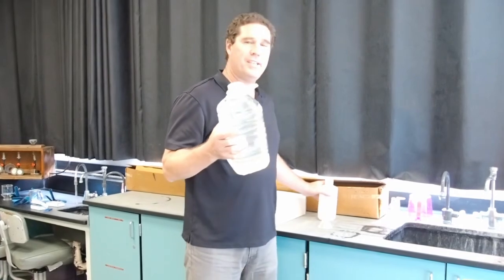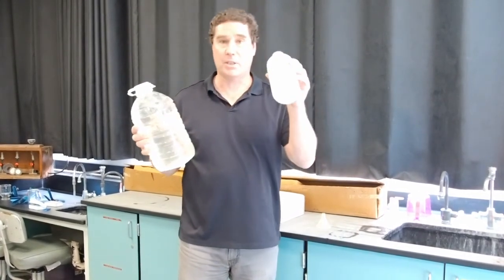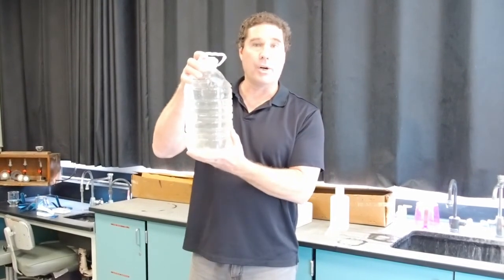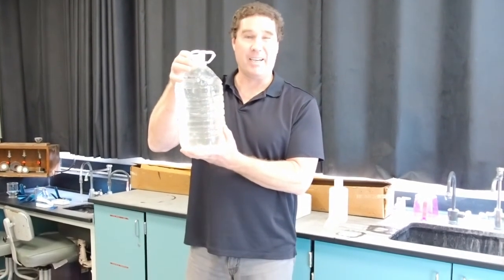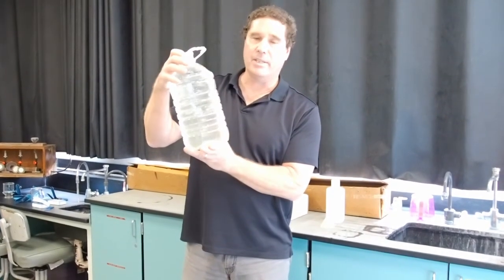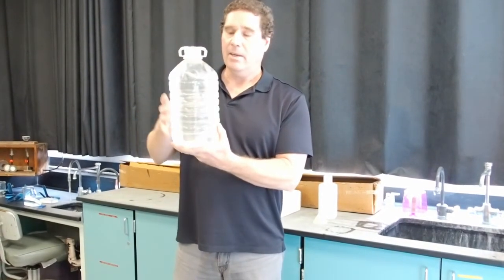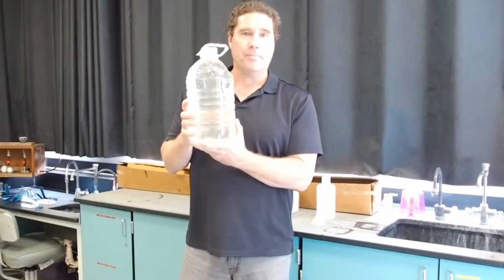Now, very often, water samples we use in marine ecology are relatively small, something like this size, about a liter. When we sample for chlorophyll, especially in the wintertime, when the sunlight is lower, we often get samples that are much larger, like this, about 4 liters in size, about a gallon or so. Because in order to get enough chlorophyll to quantify, we need to filter a large volume of water. This was collected off the side of a boat. We usually, in this lab, collect these water samples in shallow water at the surface and then deeper down at the bottom, and then compare the amounts of phytoplankton between those two depths.